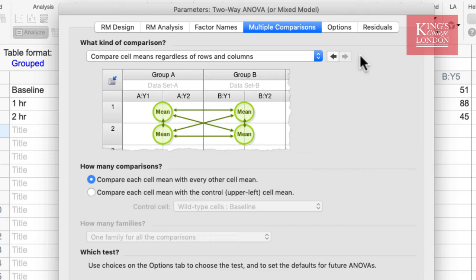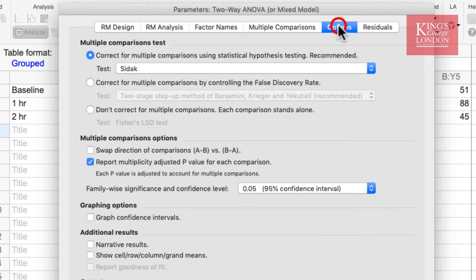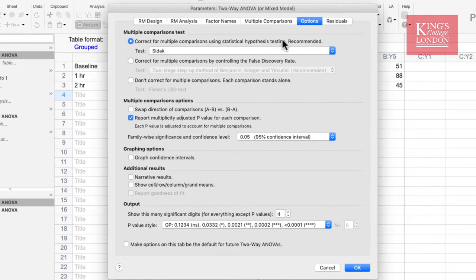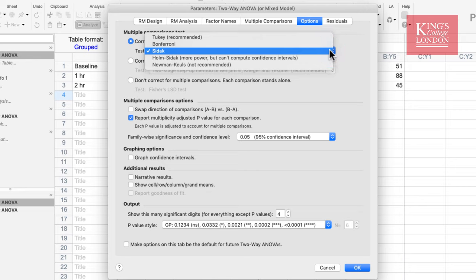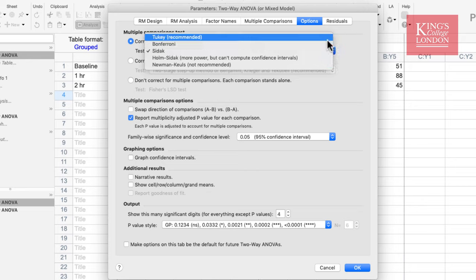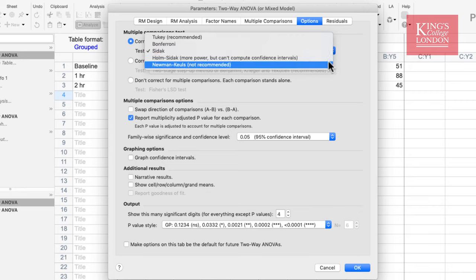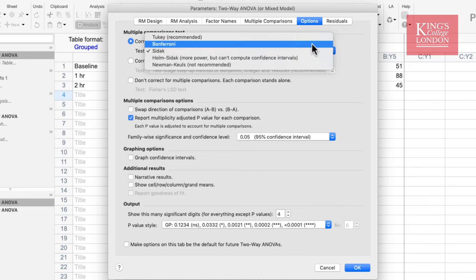Once you have chosen your multiple comparisons, you must choose the post-hoc test to be carried out. This is found in the Options pane. At the top of this window you choose which multiple comparisons test to carry out. Prism will recommend a test for you — in this case Tukey — but you also have the option of Bonferroni, Sidak, Holm-Sidak, and Newman-Keuls. Since Tukey is recommended here, I will click on Tukey.